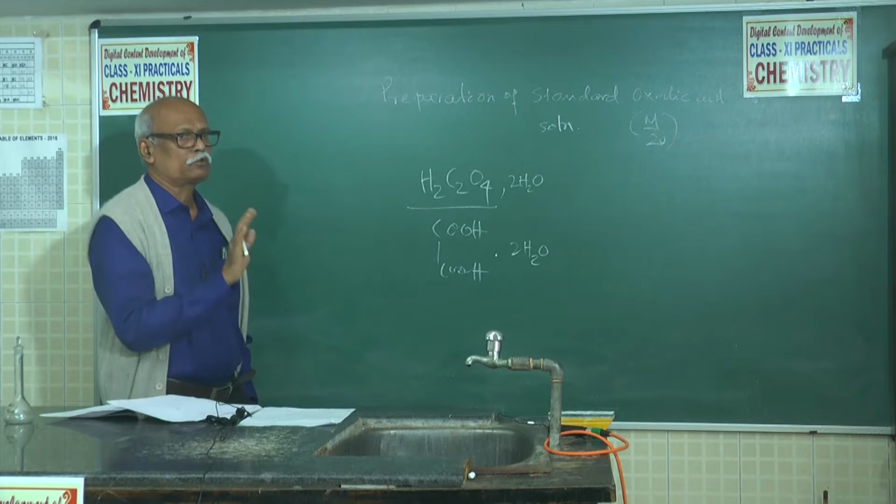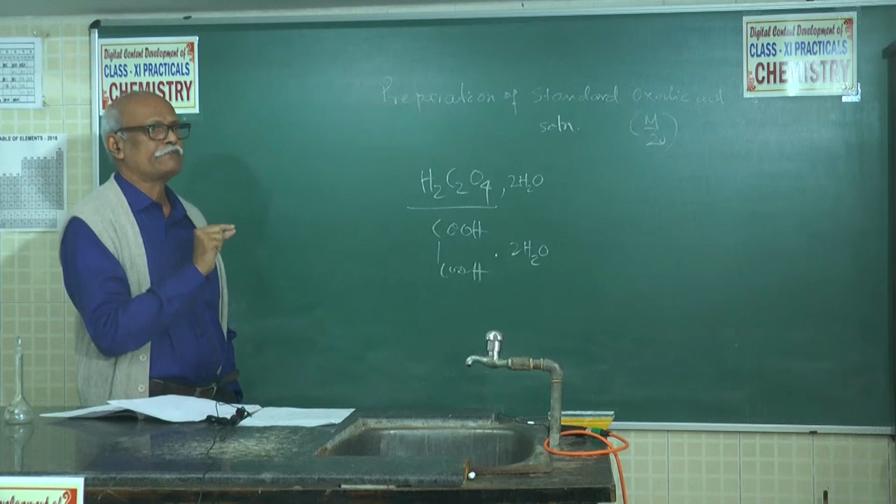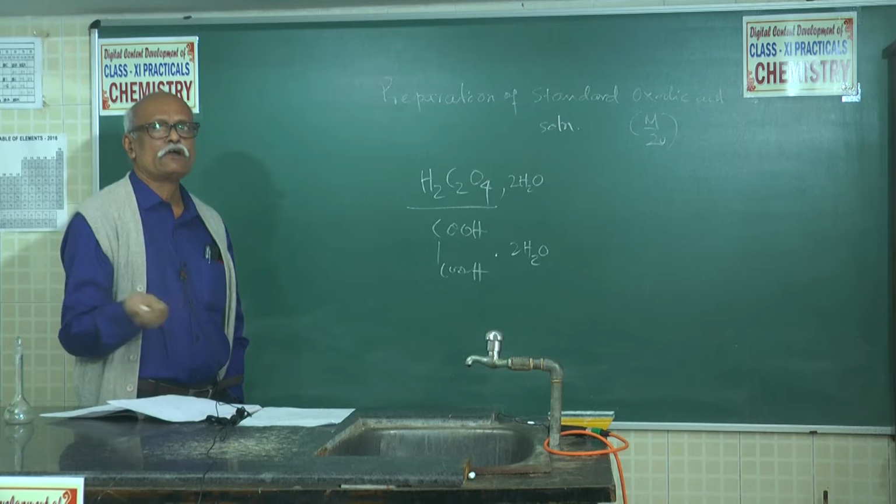So here we need 2 things. One is primary standard, of which the normality does not change if the solution is kept for years together.